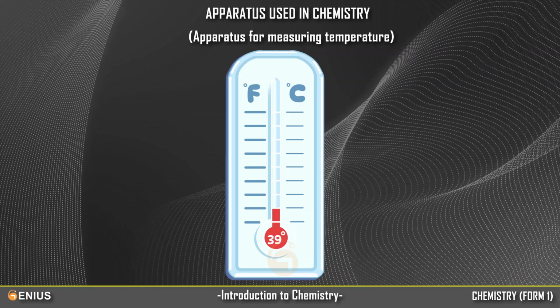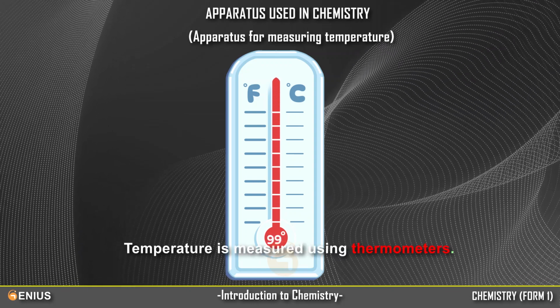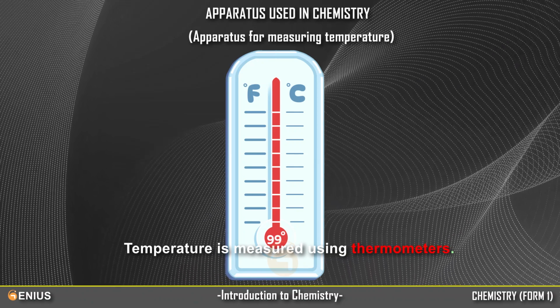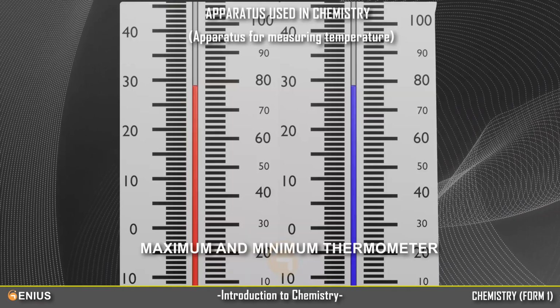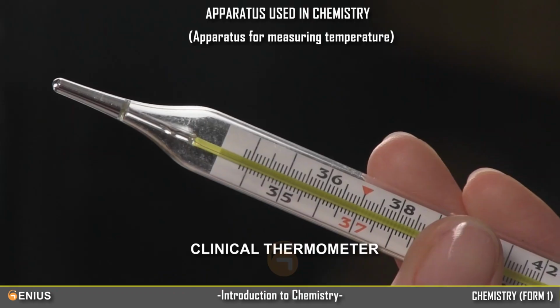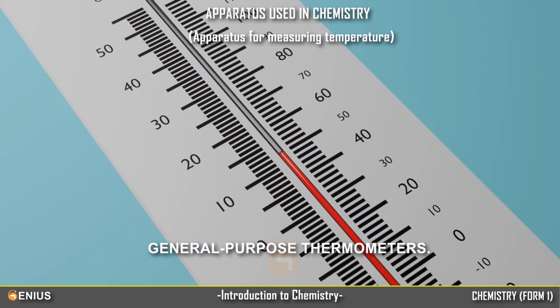Apparatus for measuring temperature. Temperature is measured using thermometers. There are different types of thermometers such as maximum and minimum thermometer, clinical thermometer, general purpose thermometers.